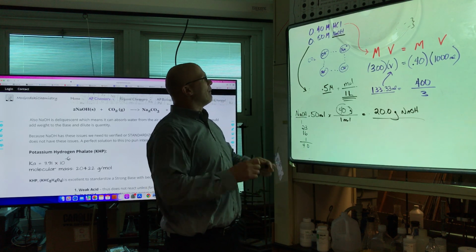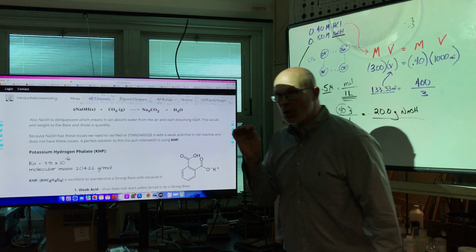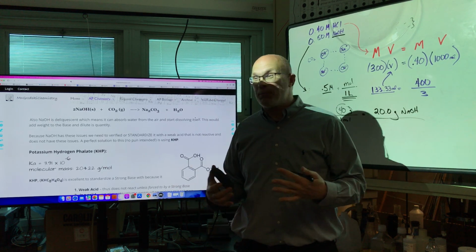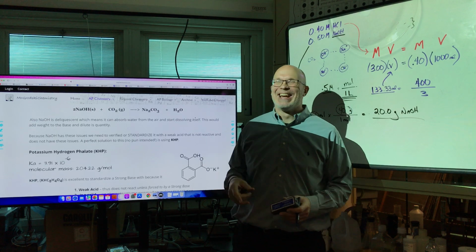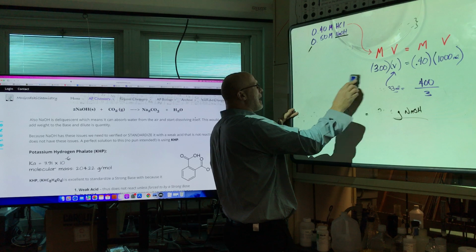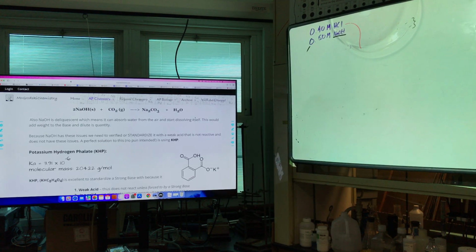Okay, all right, so I have to verify this solution. It's called standardization. You probably have heard it. Is that the percent yield? No. But percent yield is a cool thing to randomly say once in a while. Now, what is standardization? We've got to verify. It's okay, guys, I want you to calm down. It's okay that we don't know exactly what the sodium hydroxide concentration is, because we're going to figure it out exactly.